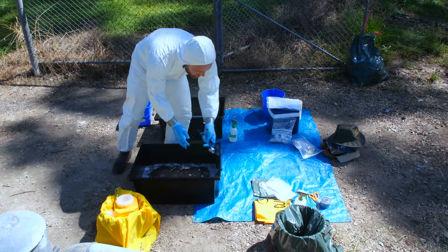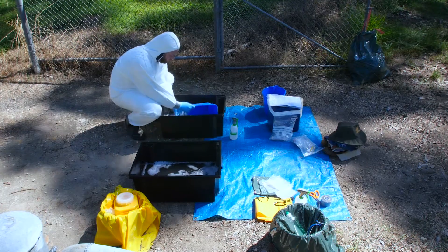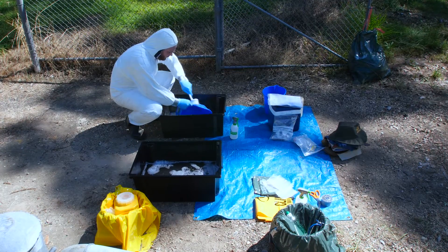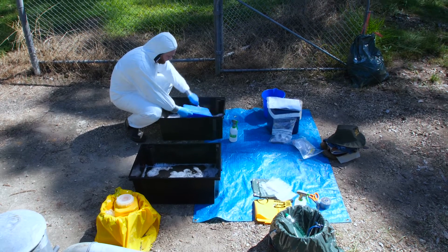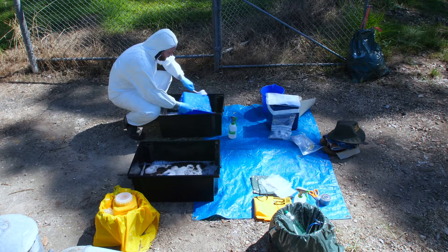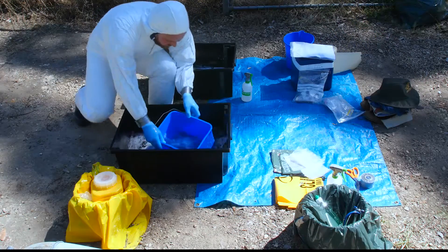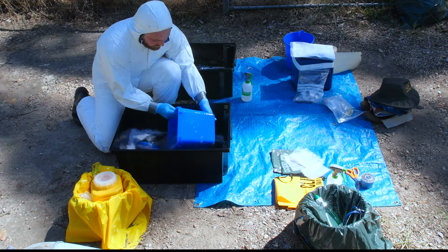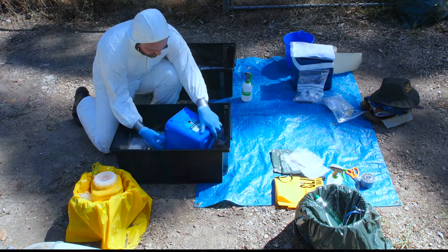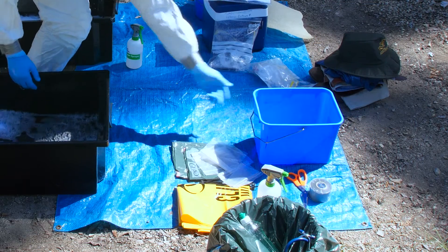Place disinfected equipment in the garbage bag previously positioned on the clean side near the imaginary line. This bag will serve as an equipment bag for reusable equipment. A bucket previously used for gross cleaning should also be cleaned and scrubbed of any remaining debris in the detergent tub, then disinfected by rinsing in the disinfectant tub or by spraying with disinfectant.